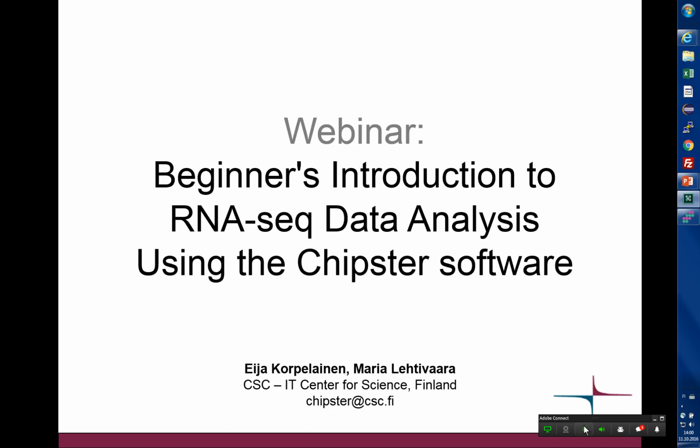And today we are indeed talking about RNA-seq data analysis using Chipster software. This is our very first Chipster webinar, and we are really keeping the topic very brief today.